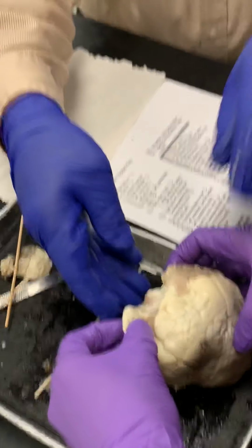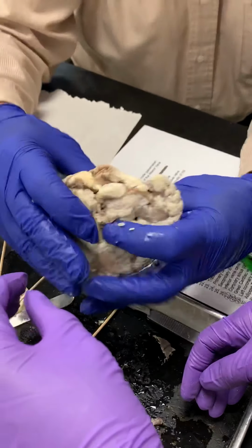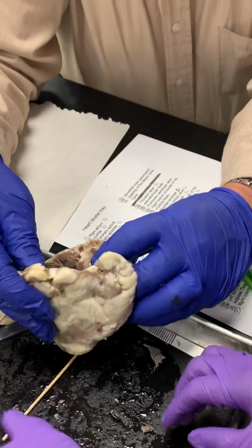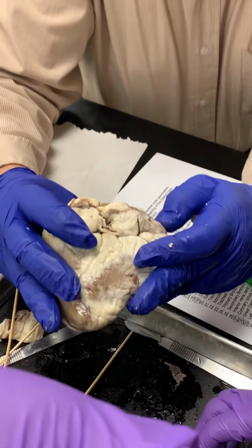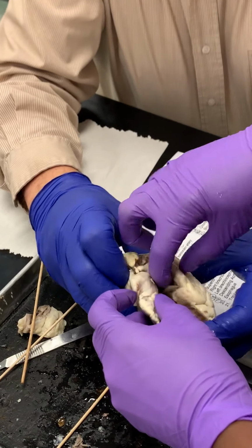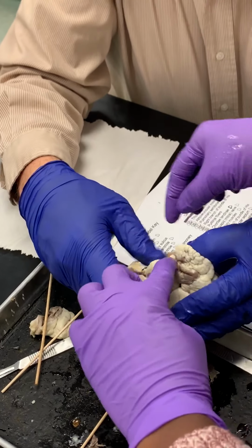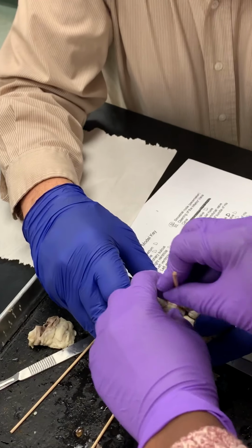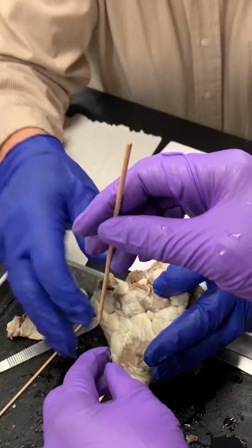On this, I don't think it, like sometimes it's there, it depends, because it might be cut completely. Yeah, this was cut off completely. If you just see the aorta, then usually it's cut. Where'd we go with the aorta? The aorta is right here. Yeah, if it's cut real low, then you just see the aorta. The aorta comes through this way, and it leads down here. So actually, well, let's see. Where does this go then?